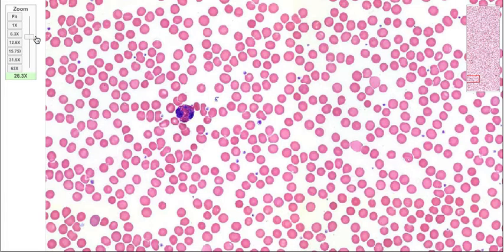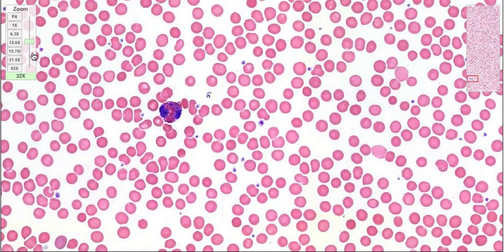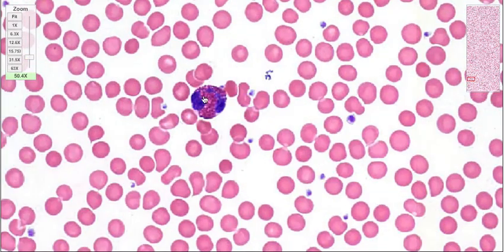As you can see, if we zoom in a bit more without it getting too fuzzy, they have more than one component to the nucleus. So there's one here, a smaller one here, and another one there. So when distinguishing between neutrophils, they essentially stain more, because the acid stain you use for a blood stain typically stains these guys a little bit harsher.